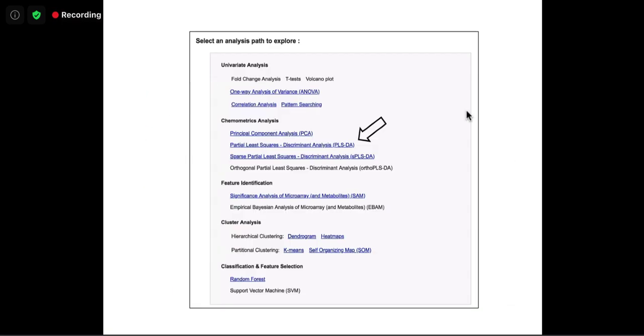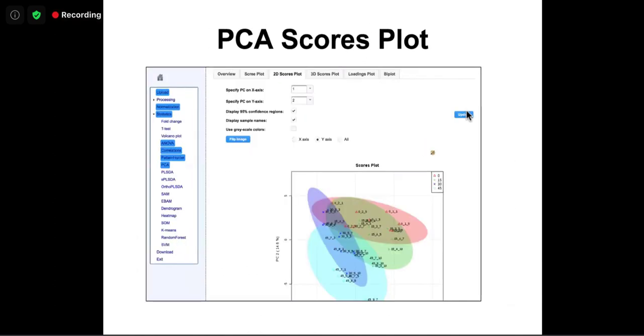I think I received that email before, and I'm not sure. PCA is unsupervised. It's really about inherent patterns within your data, and there's not much model assumption. For me, I found it's puzzling. I don't get it, I can tell you honestly. Of course you can write a program to test it, but what is that testing for? I can tell you the other thing is probably more meaningful.